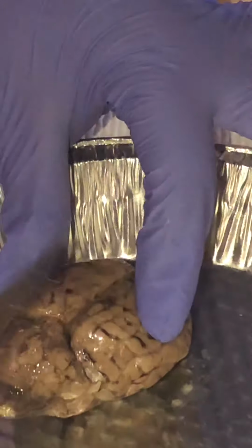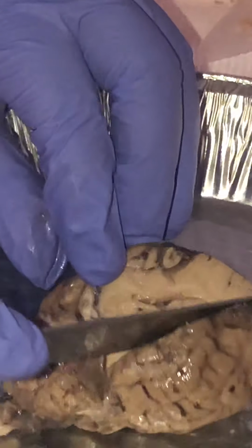So, I'm going to go ahead and just cut it in half. Ew, so squishy. Okay, so I did a sagittal cut on here. I'm looking for a lot of things inside, which is going to be kind of difficult because it isn't how it was on most of the slides and videos. But let's just go ahead with what we have.